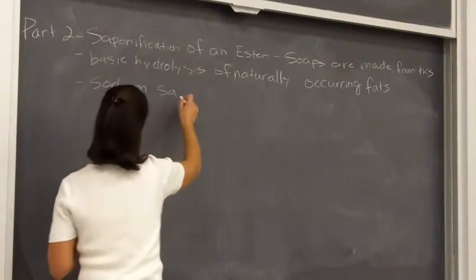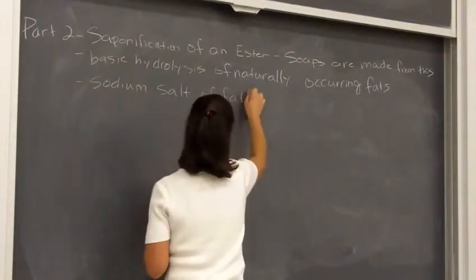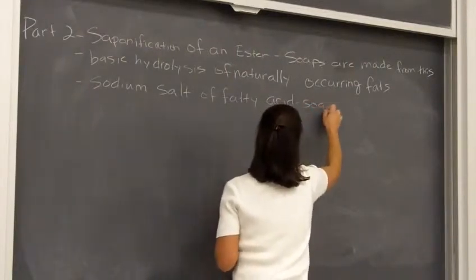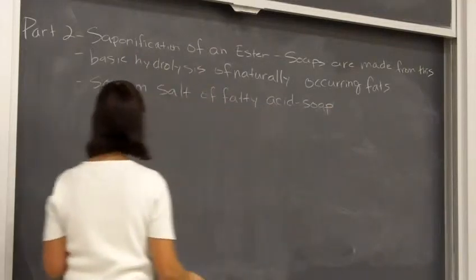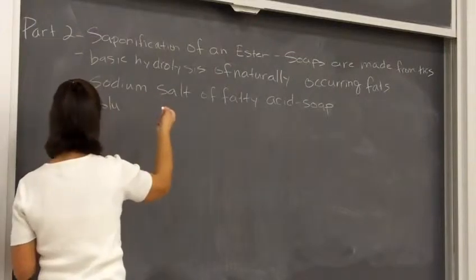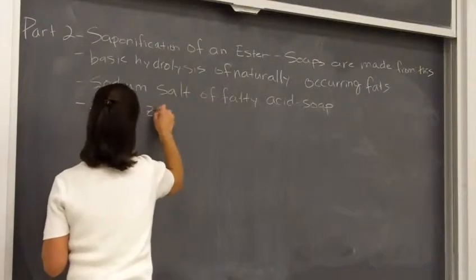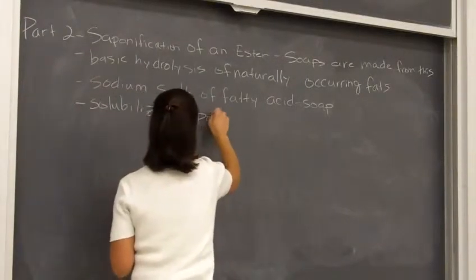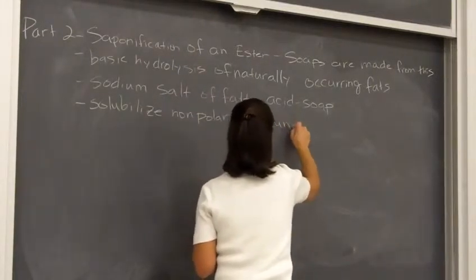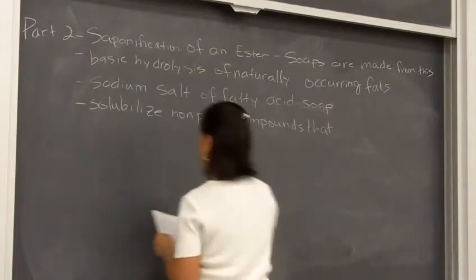In general, when you do this base hydrolysis, the sodium salt of the fatty acid, that is the soap. And so it's a way to solubilize non-polar compounds that wouldn't be soluble in soap alone, or sorry, in water alone.